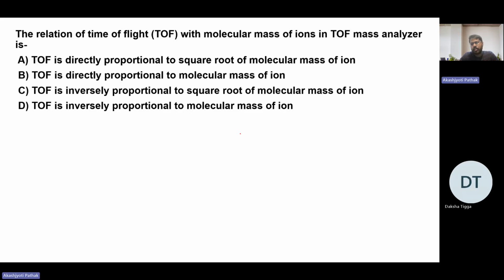Now this charged ion will move towards the negative electrode. Depending on the mass to charge ratio of that particular peptide, one peptide will move earlier, another will reach later. All the ions will experience the same force, isn't it? What force will it experience? It will experience Q into E, the charge on the protein and the electric field.